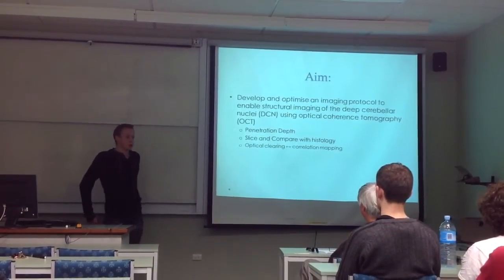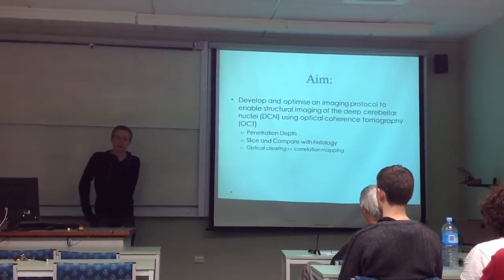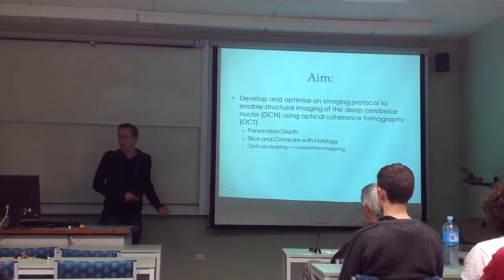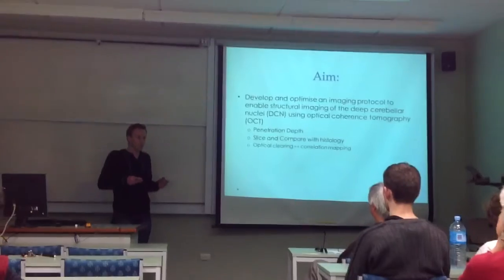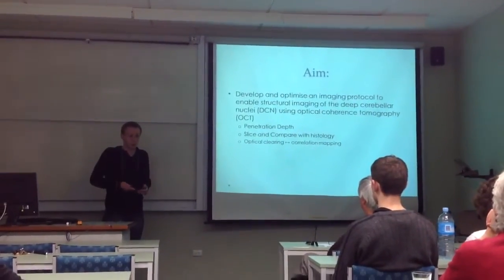I then am going to try and pull even more information out by combining what you just heard about before, cross-correlation, with optical clearing, and try and image the diffusion front of the optical clearing solution moving through the tissue.